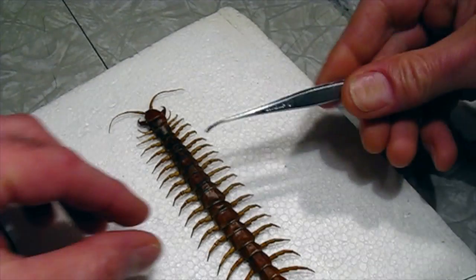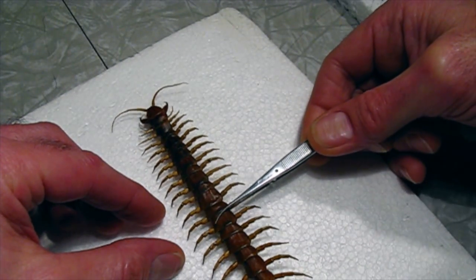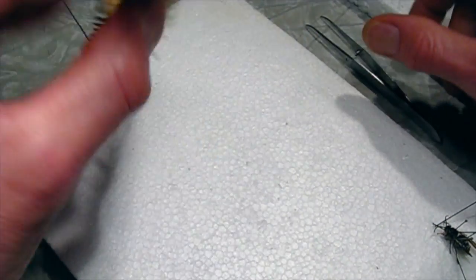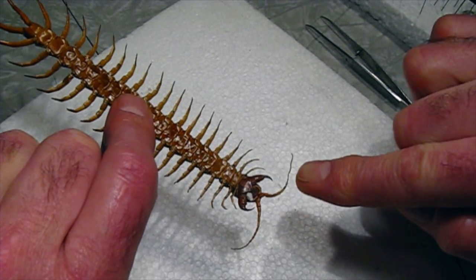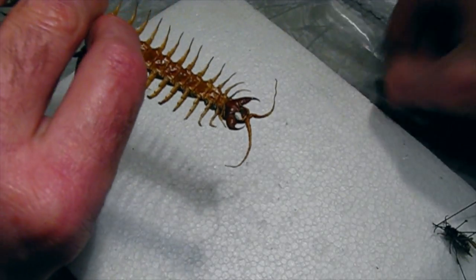Now, since we didn't put a pin through this one, I have to lift it gently. Oh yeah, dried out really well. The antenna is shriveled up slightly, but they are fragile. Overall, they look pretty good.